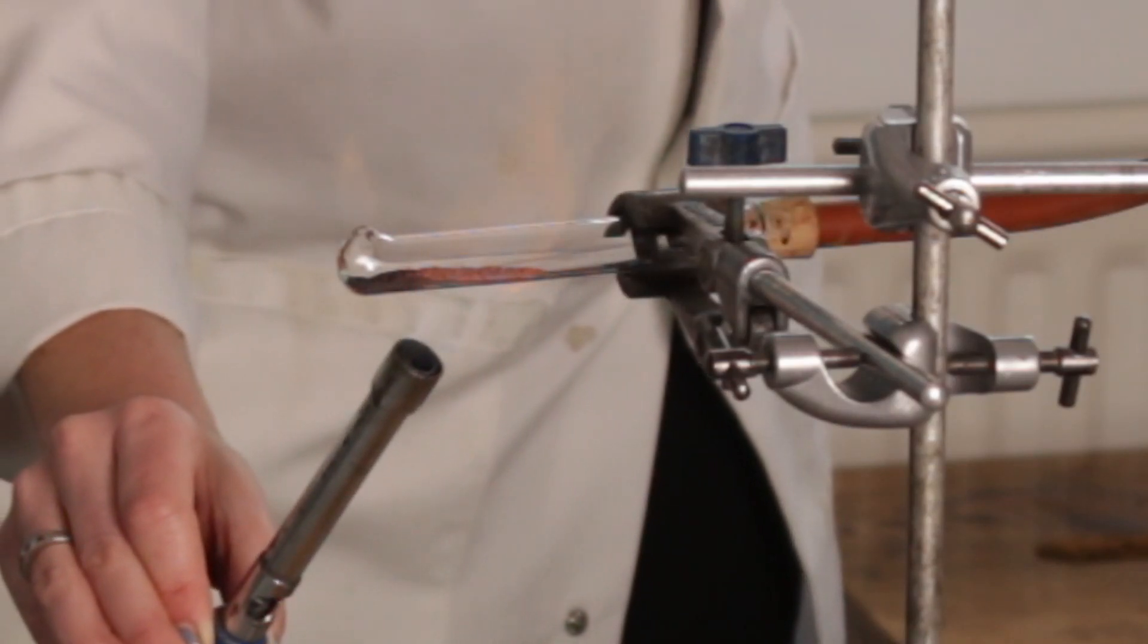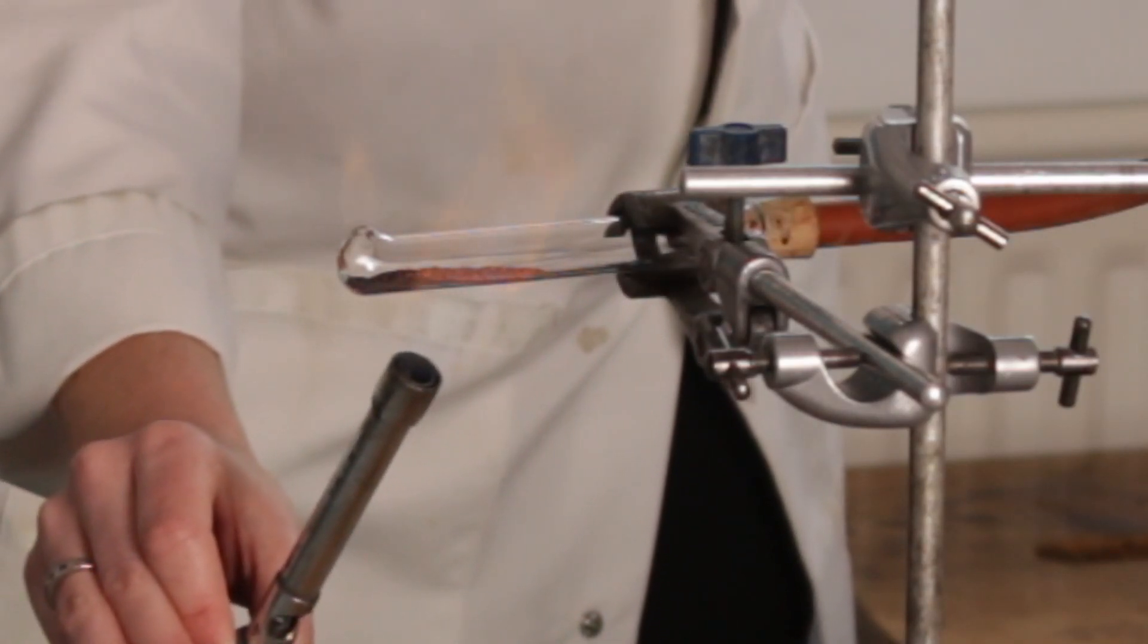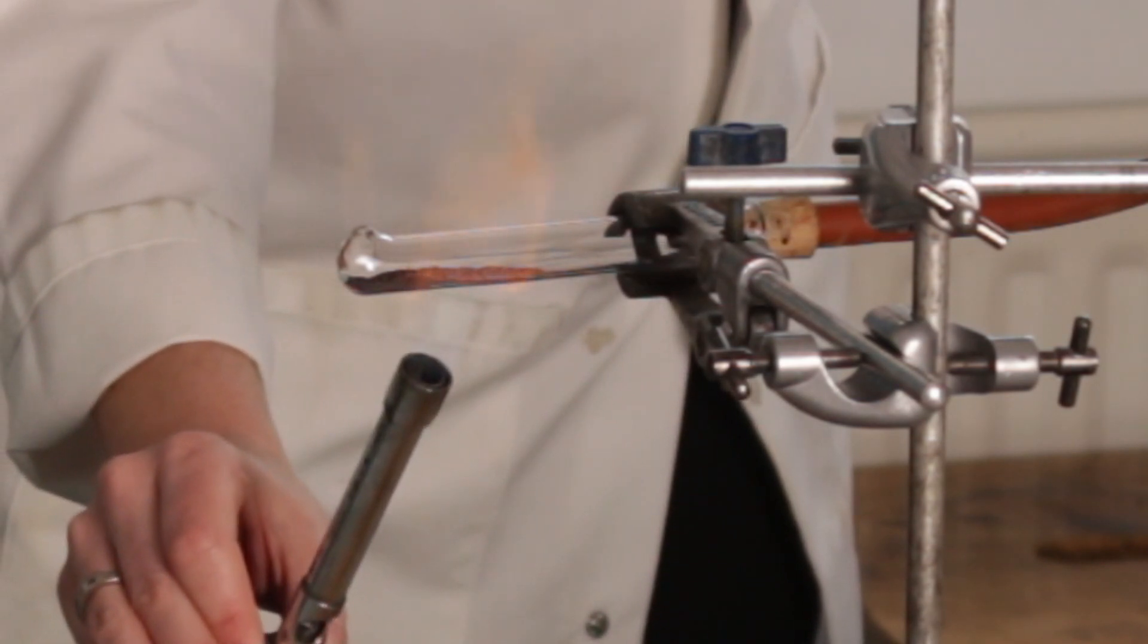So we can see there's a really nice colour change going on on that copper oxide now. About two-thirds of it has gone this lovely orange colour.